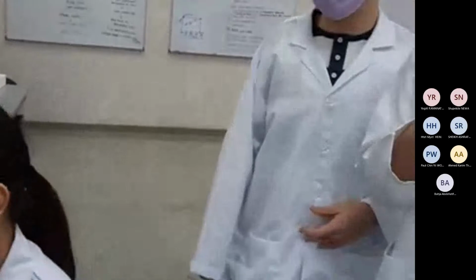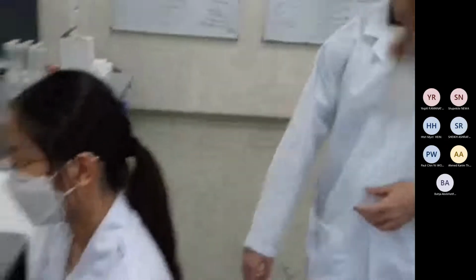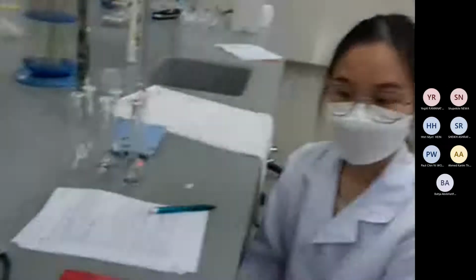And then you have to take a blank first. Blank means distilled water, because we are preparing the solution with distilled water. So distilled water should be used as the blank. Take the distilled water, put it inside, and cover it. For the blank, press 0, the yellow button.